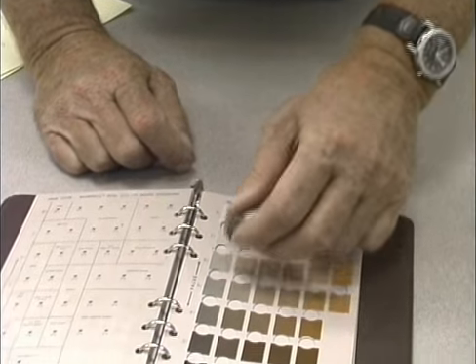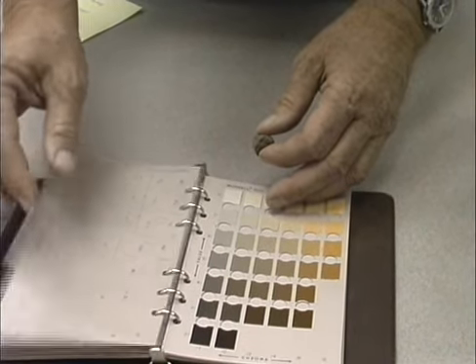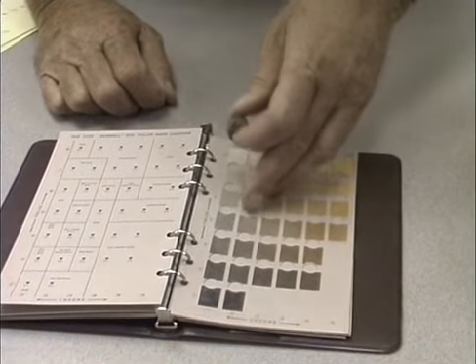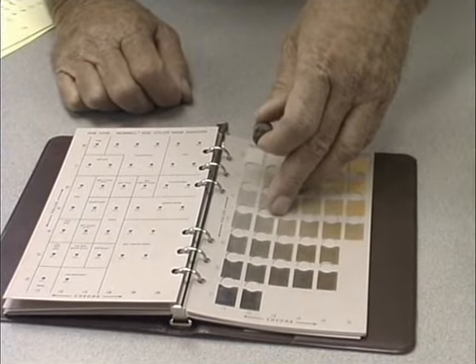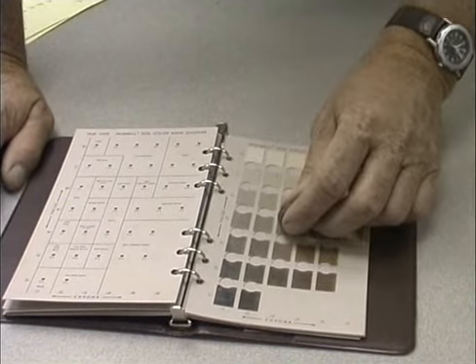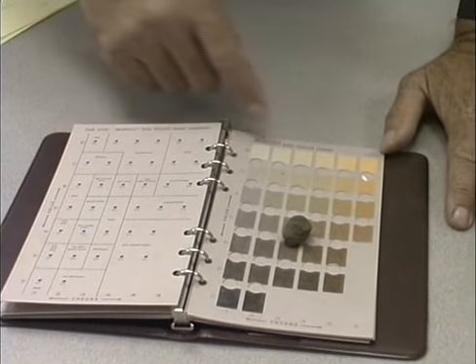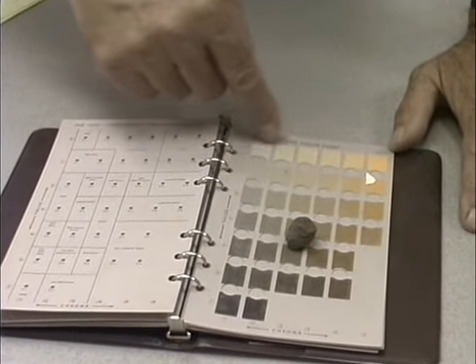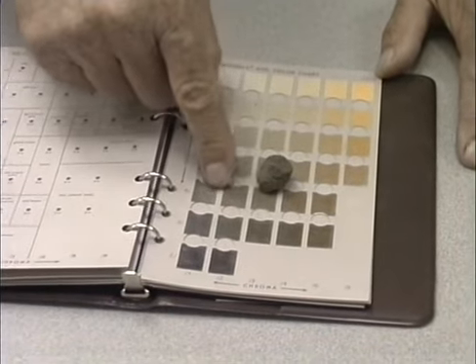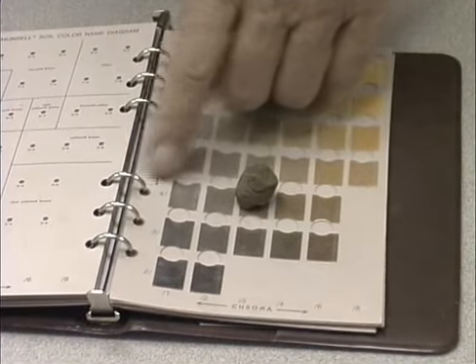So I place this. One of the important things to remember if you're utilizing one of these Munsell color charts is to use the protective acetate sheet that comes with that so you don't start getting soil samples on your color plates. If I place this onto this color chart, I see that I'm probably in the right hue range. I'm not up in here where I have a much higher value, or numerical number for value, but I'm more down into this range on this particular value row.